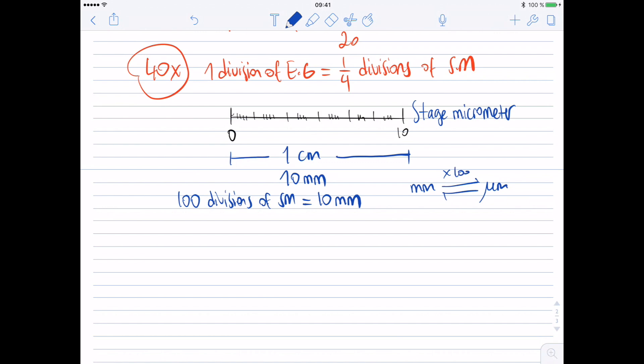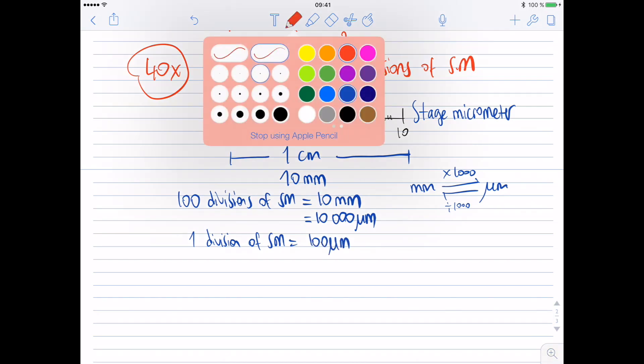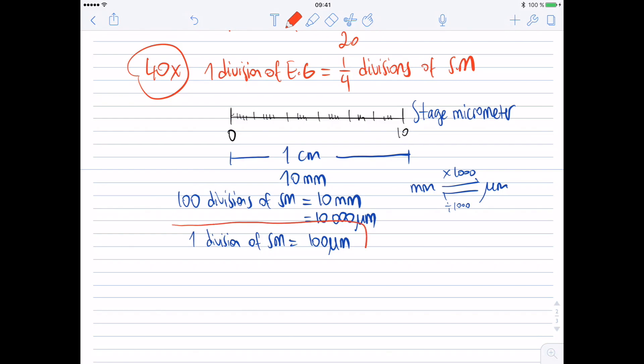From millimeter to micrometer, multiply by one thousand; from micrometer to millimeter, divide by one thousand. So ten millimeters equals ten thousand micrometers. Therefore, one division of stage micrometer equals 100 micrometers. This is the value I need, and this is a value that is not going to change according to magnification.